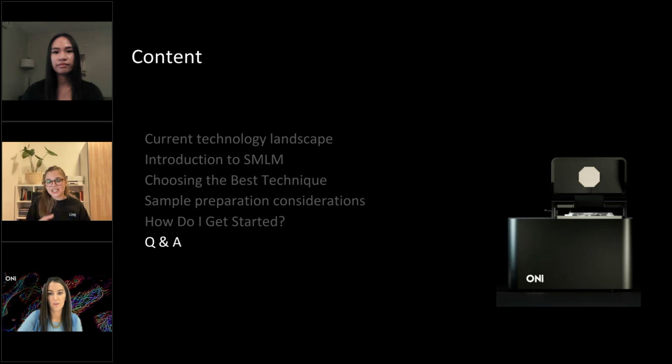Yeah, then it sounds like it's a low labeling, 5. So you want to make sure that if you label your virus and you track it, of course, you have a really, really bright dye, okay? Because yes, we can detect single molecules, we can detect one single fluorophore, but it has to be rather bright in intensity. And again, there are some recommendations in literature on how to choose your brightest molecule for tracking purposes.